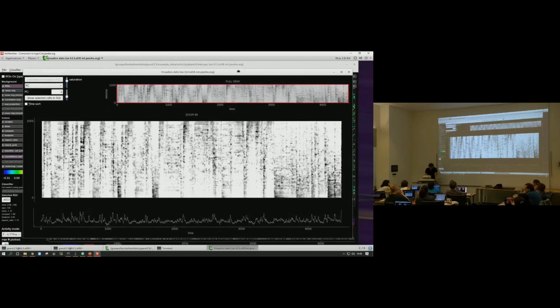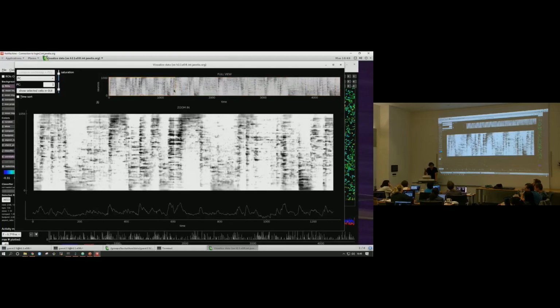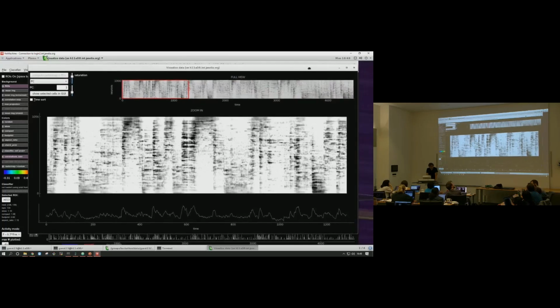And because we think this is spontaneous activity, we know these are just spontaneous activity patterns happening in the mouse visual cortex, which have to do with the mouse's own behavior and its behavior on the ball. So we know by now what these patterns mean, but then you'll run it on your own data set and you'll see some patterns emerge. You'll want to see what parts of your experiment you can correlate those to. And this view is going to be a little bit different whether you run it with spike deconvolved data or with just neuropil subtracted fluorescence.